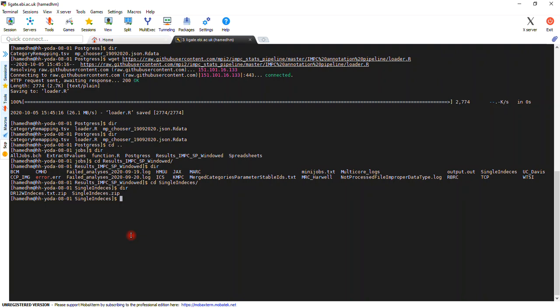I just cp the dr12w index and copy that to the directory that we use to work. So it is, I guess, here now, one more. Okay, it's here. I cp that. Okay, I'll come back to that directory now.